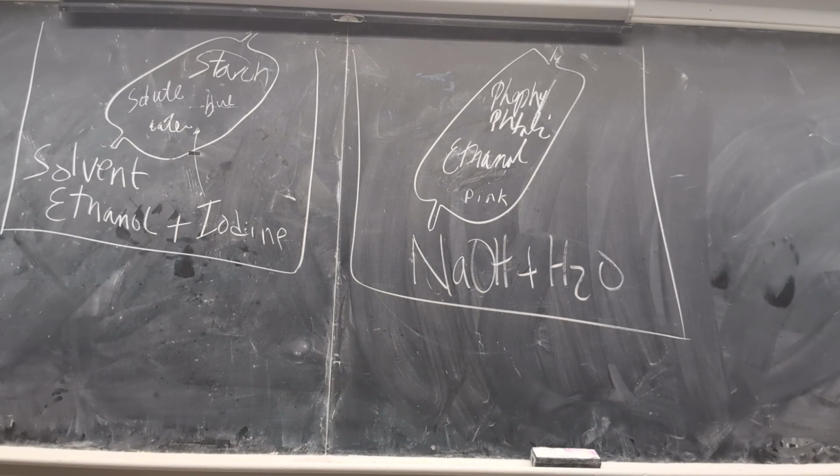Drops. Guys, is that a solution? That is tiny. So add much more. Chanel, I said add like 15 milliliters.